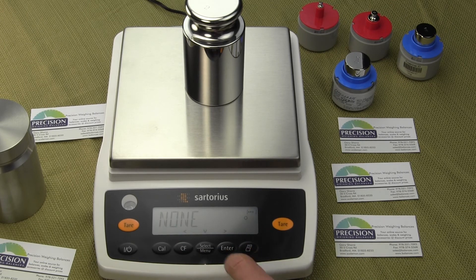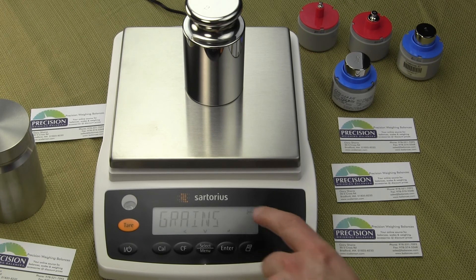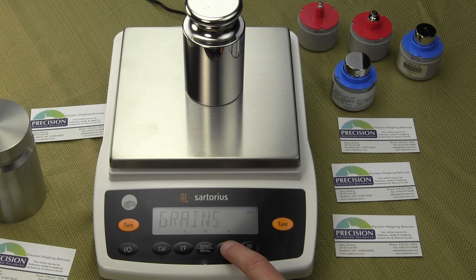Now we want to go to the third one. Press the arrow key and you'll notice there are three dots in the upper right-hand corner. Select the weigh unit by pressing the select menu button, and this time we'll weigh in grains. Notice there's no zero yet — it hasn't been stored — so simply press the enter key and that value is now stored. Finally, we can go to the last weigh unit. This time we'll store it for pennyweight. There's no circle yet, so simply press the enter key and that value is stored. Hit clear function to get out of the menu.